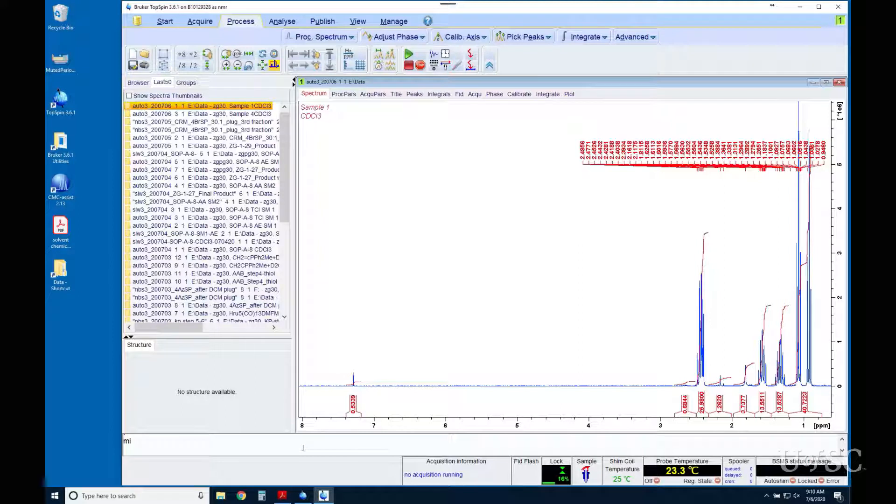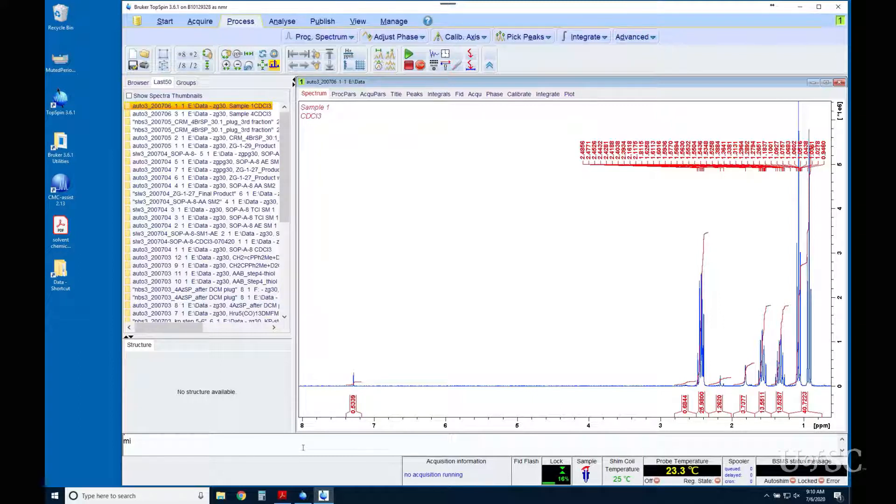Poor phasing will lead to inaccurate integration and chemical shifts, so do not think bad phasing is just a cosmetic problem.